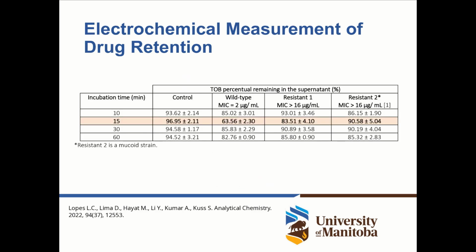Of course, we don't carry out these studies just once, but we are doing a large analytical investigation here. So the plot that you have just seen is one experiment that corresponds to the highlighted section here for 15 minutes of incubation. But we also investigated longer incubation times where we see that this difference in current response is not as pronounced. And we validated this with fluorescent microscopy because these cells are just too stressed. They are breaking apart, and tobramycin is given back into the solution before centrifugation if the incubation time is too long.